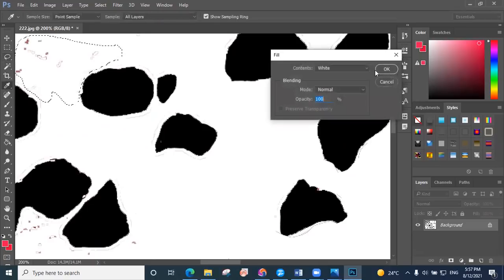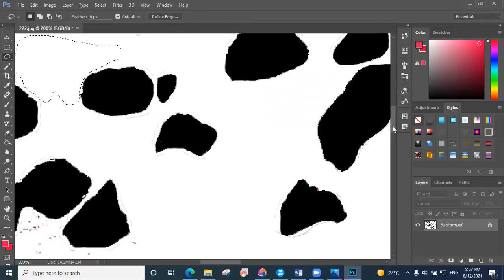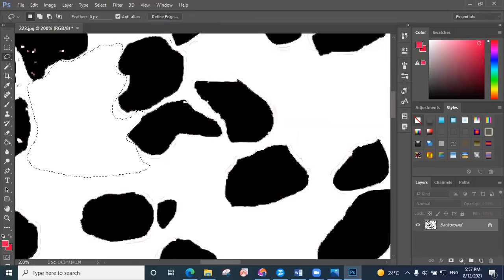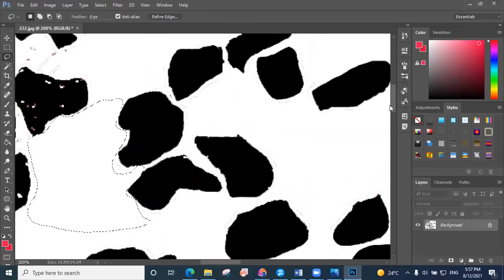And if you take the photo on OM, to determine the grains, choose black and white colors. If you choose colorful, you will face this problem. Hopefully you will not face this, because it takes a longer time to clean.